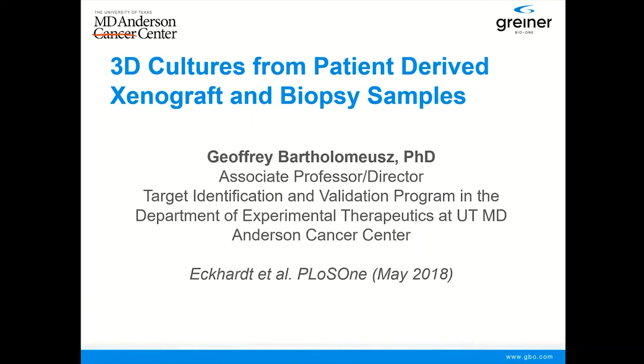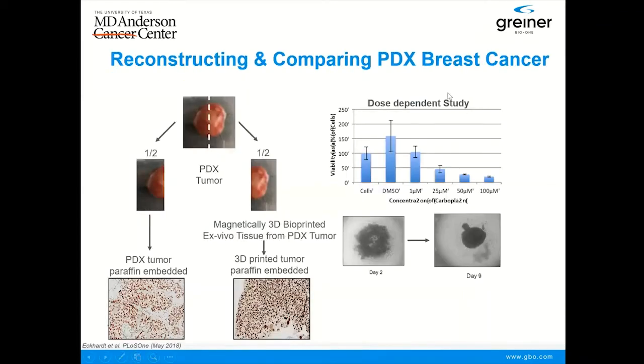We took patient samples, triple negative inflammatory breast cancer. We cultured in the animal, and then we took the tumor and we compared those same cells. If we take those cells and make a 3D culture, how does it compare to the original tumor? So here's the work. We took the tumor, patient to animal, animal to here.